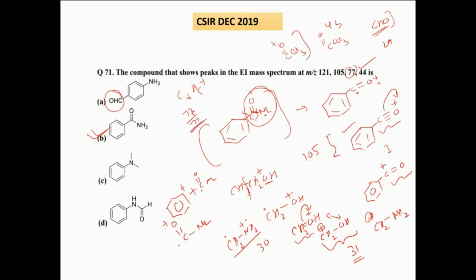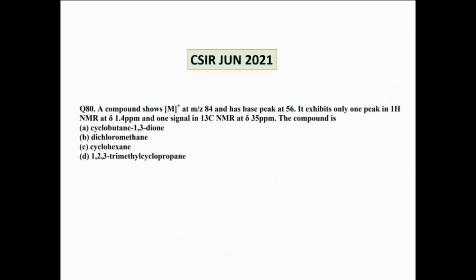And then option B. Yes. Okay, ma. இது வேற எந்த மாலிக்யூலையும் இந்த ஃபிராக்மெண்ட் பண்ணவே முடியாது. இது இந்த பக்கம் போச்சுன்னா 14, it will go as 16. இங்க போச்சுன்னா 29 போயிடும். So 45 வெளியே போகுது. So இதுவும் நடக்காது. 77ல பீக் இதுல வராது. So option B is the right answer.